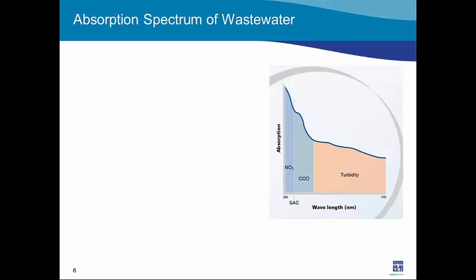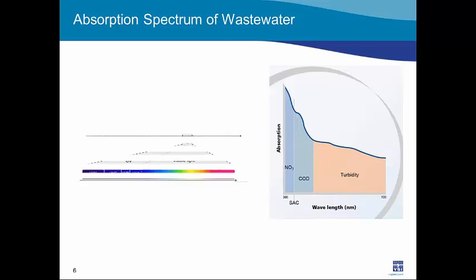Also, you'll see that the parameter spectral absorption coefficient, or SAC, which has been used as an optical monitoring parameter in traditional optical measurements, monitors only one wavelength. So when you use a probe that measures SAC, you're getting a probe that monitors one wavelength, and then the user correlates the concentration of the sample with the absorbance of that particular wavelength. Useful, but it could be better.